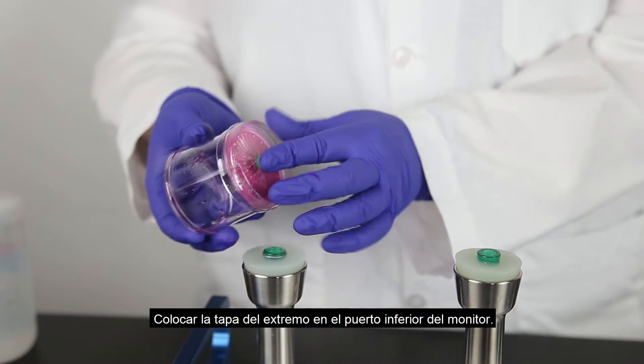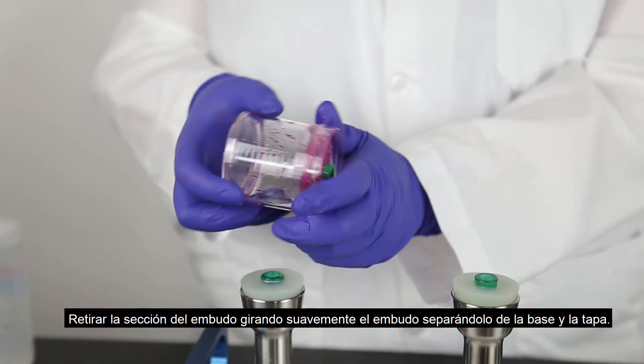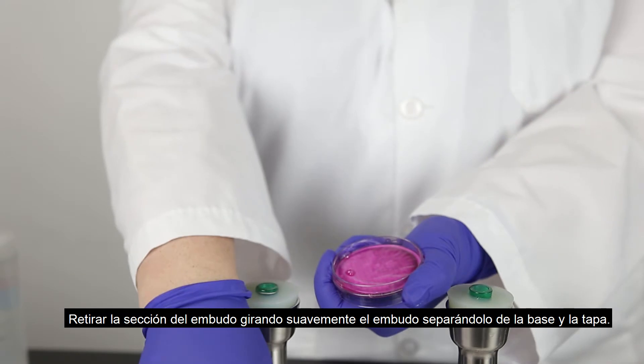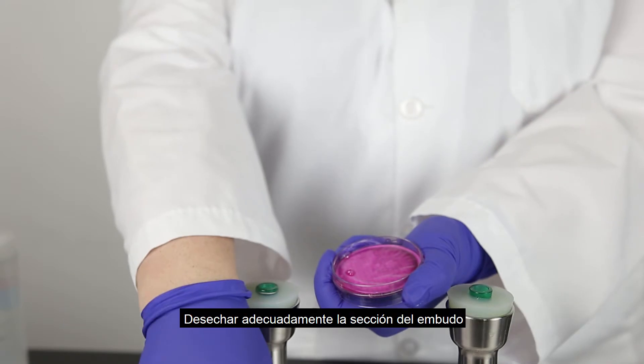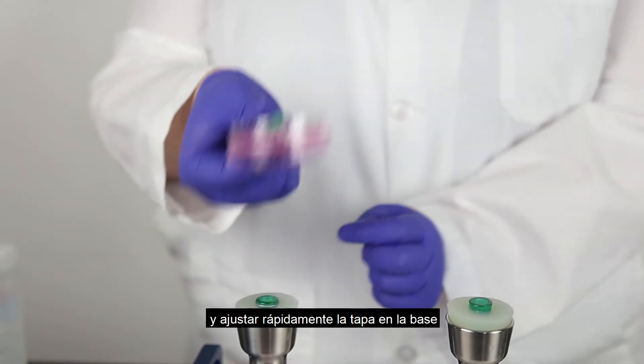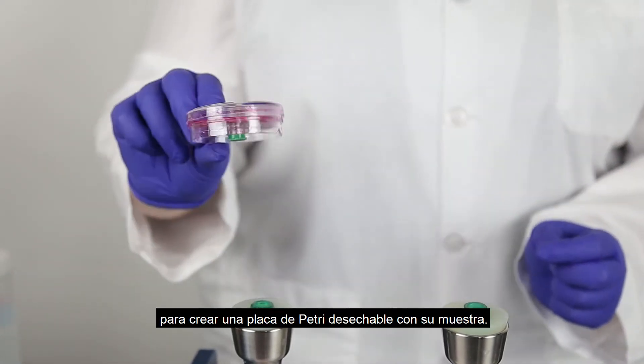Place the end cap on the bottom port of the monitor. Remove the funnel section by gently twisting the funnel apart from the base and lid. Appropriately discard the funnel section and quickly fit the lid onto the base to create a disposable petri dish with your sample.